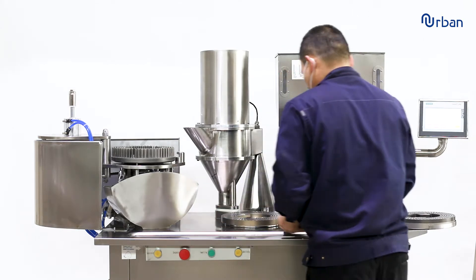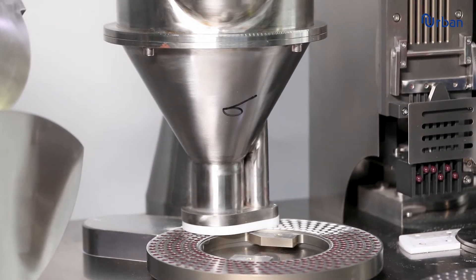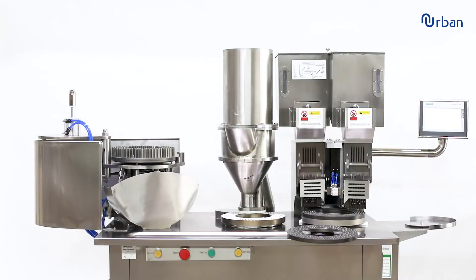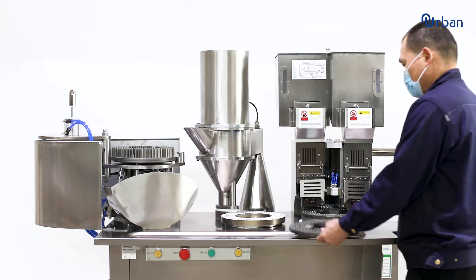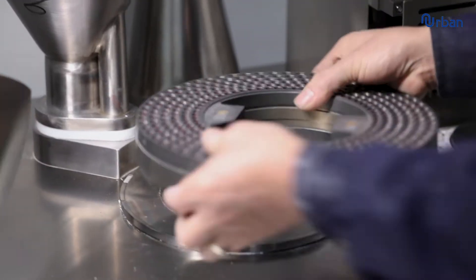A special design allows for changing the mold for different capsules within 15 minutes, easily and precisely. It can fill material in powder, pellet, or granule forms.